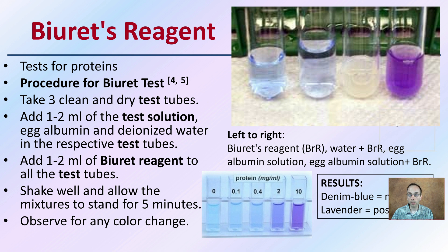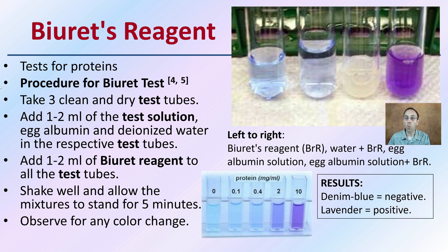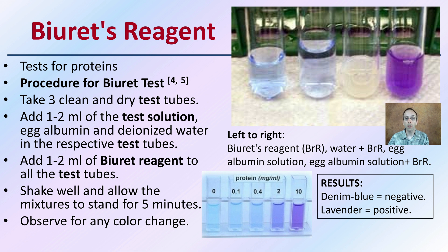Finally, we have Biuret's reagent, which tests for proteins. Allow this reaction to occur for up to five minutes — it is not a quick reaction. A denim-blue coloration is negative, while a lavender-purple coloration indicates a positive test. Hopefully this helps determine what common household white powders you're dealing with. Remember to follow all laboratory procedures and stay safe, even with low-toxicity substances, as some of the reagents require careful handling.